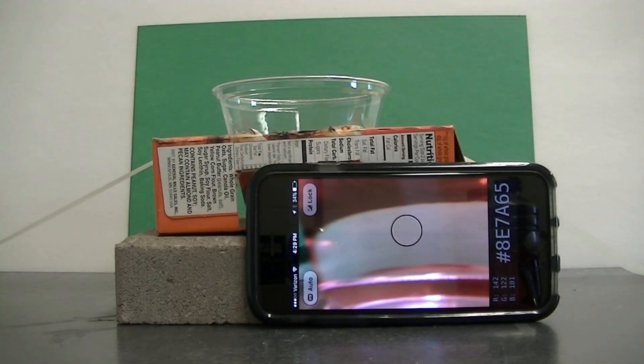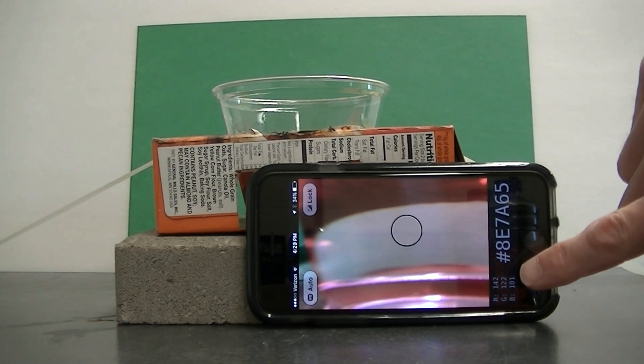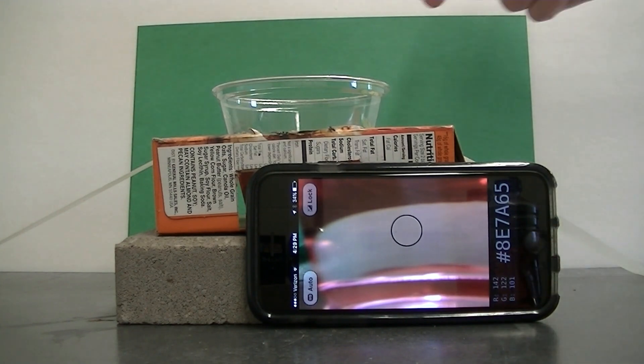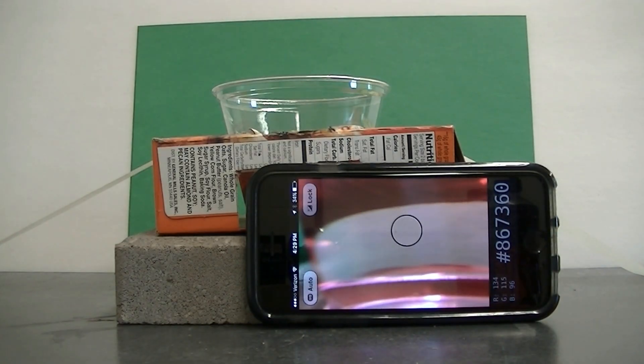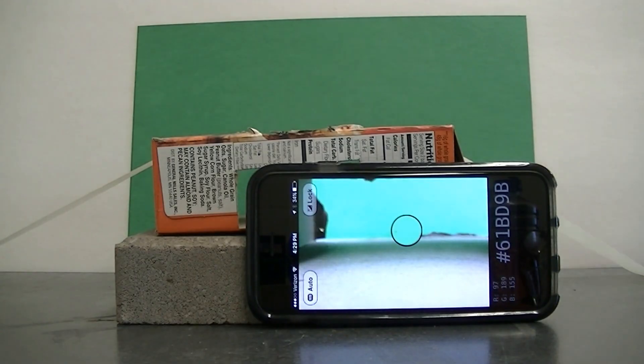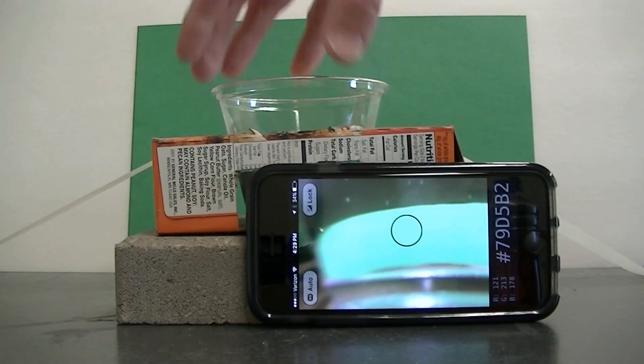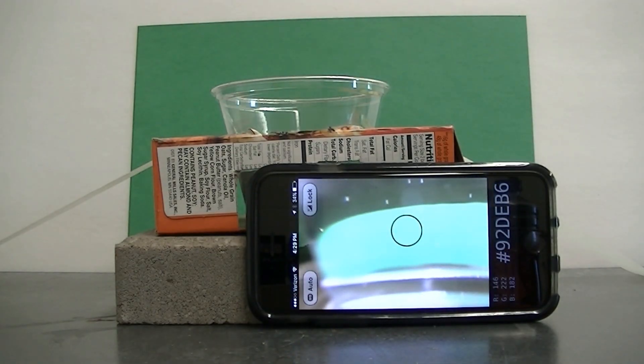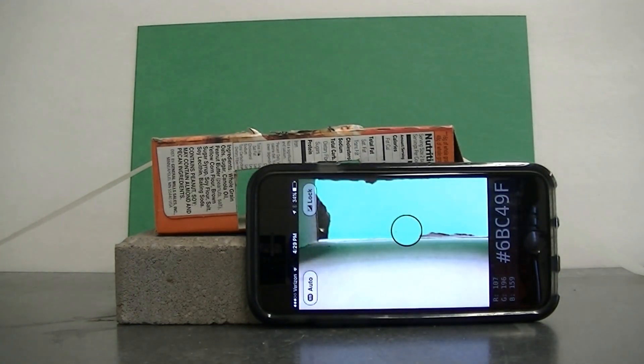Now what we can do is we can compare the G value when light is passing through a red solution versus when it passes through water. And if I look at that G value right now I see it's reading about 115. If I remove this particular cup and place in a cup that has water in it I see that that G value is much higher, it's reading 222. So I see that the red dye is absorbing green light.